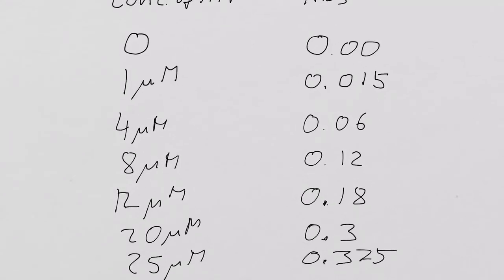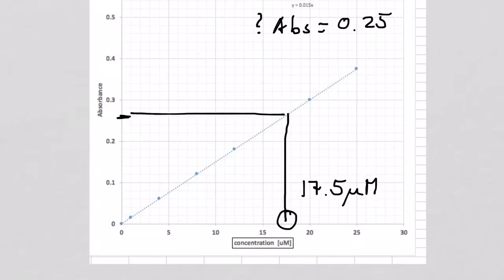So here's the concentration. And here is the absorbance. Not terribly exciting, but we actually need that. And it is fairly accurate. Okay? Any questions? Really trivial, the whole thing. But we have to do the standard curve first, and that is where a lot of people have problems. Okay, so you should be able to read from a standard curve.